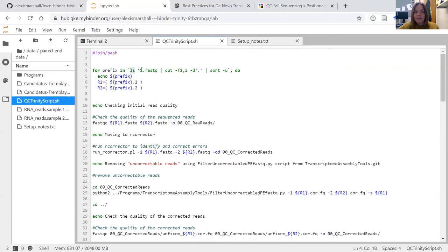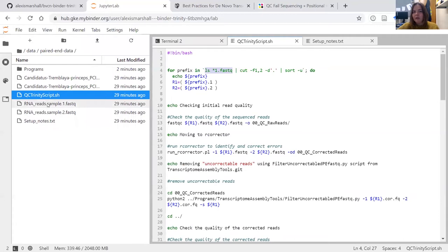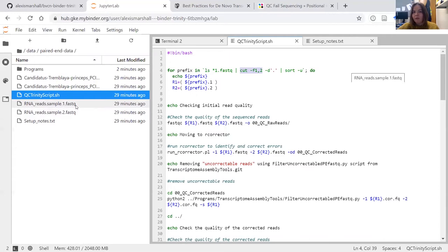We've asked the loop to go in and list all files within this directory that end in '1.fastq'. There's only one file like that here. We've asked it to cut the first and second fields based on the delimiter of a period or full stop. If you look at how the file is named and break it up by periods, you get four fields. We're asking it to take the first two - 'RNA_reads.sample' - to make a unique list. So 'echo prefix' will output 'RNA_reads.sample', and read one and read two are then 'prefix.1' and 'prefix.2' to differentiate them.